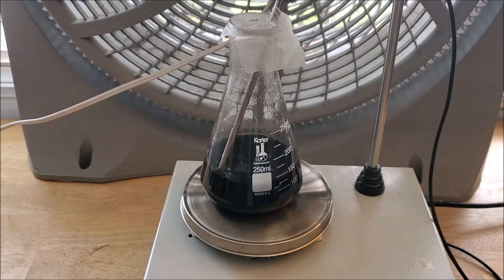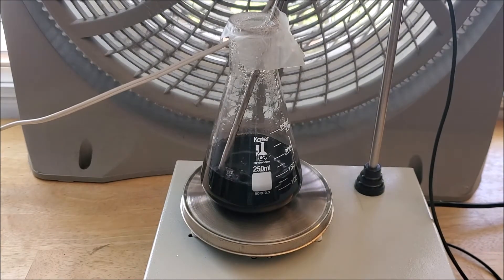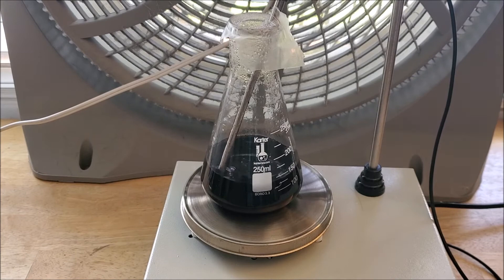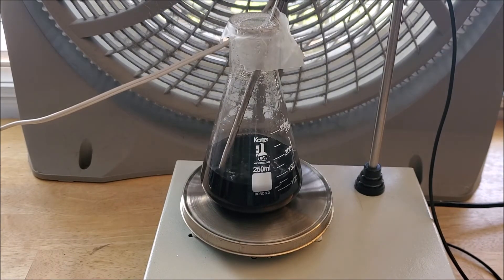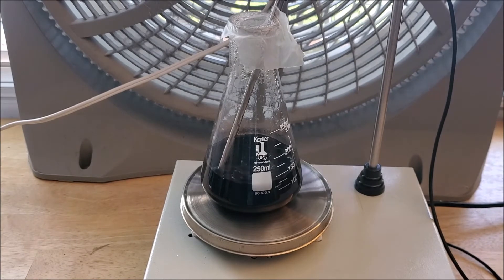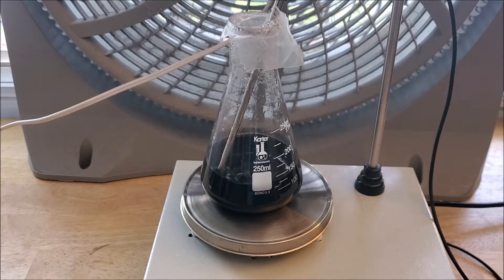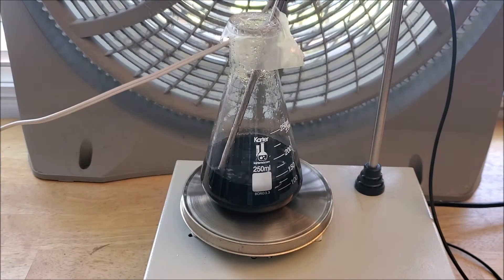All right, now that I talked about what you need to perform this reaction and how to do it, I want to talk about what's actually going on in the reaction because it seems like a lot of people want to learn about that kind of stuff. So first thing that needs to happen is the acetyl acetone needs to get deprotonated. The reason why we have to do this is because the acetyl acetone can't really coordinate unless it is deprotonated and that's what we're doing here. We're coordinating the acetyl acetone to the chromium 3 ions.